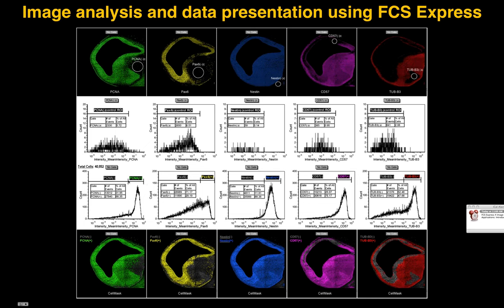And in order to verify, we then show the ungated histogram in the third row. The ungated histogram will show you the negative area and the positive area, but because we already have identified the threshold for the negative, we just extrapolate that and then extend the positive region away from there to the maximum fluorescent population.